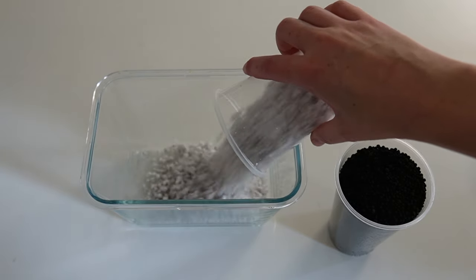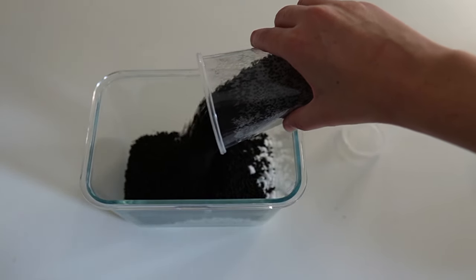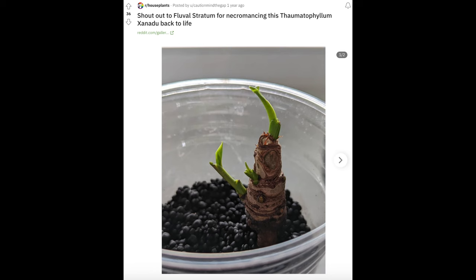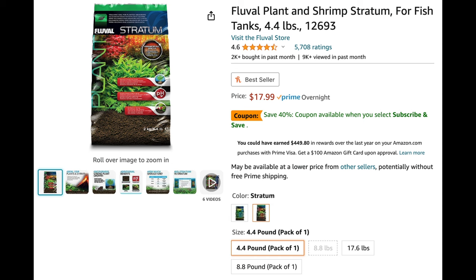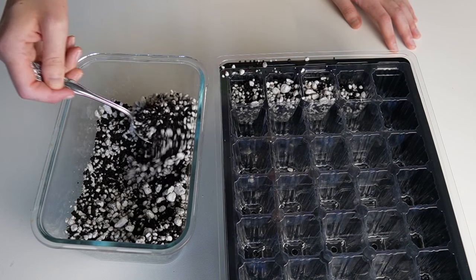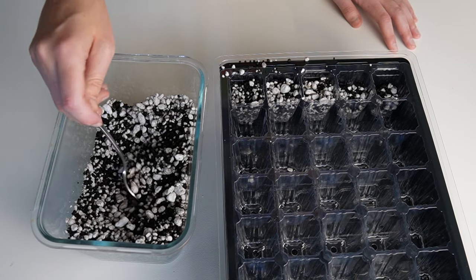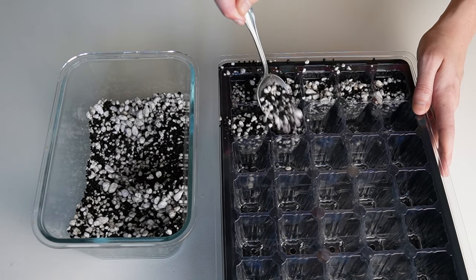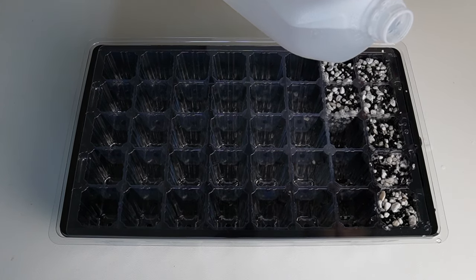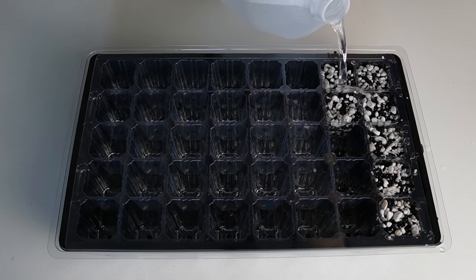To make the media that I'm going to be planting these in, I mix 50% perlite and 50% fluval stratum. Fluval stratum is an aquarium substrate for aquatic plants, but a lot of people like to use it to root terrestrial plants as well. It's also somewhat expensive, so that is why I mix it with the perlite. I pre-moisten the media with distilled water — I just dump the jug over the media like an absolute neanderthal, but a more refined individual would probably prefer to use a squirt bottle or perhaps even a watering can.